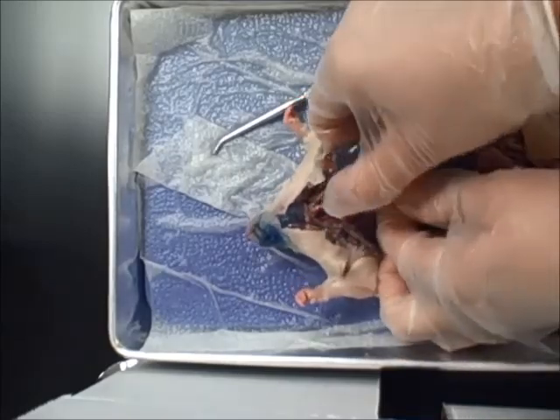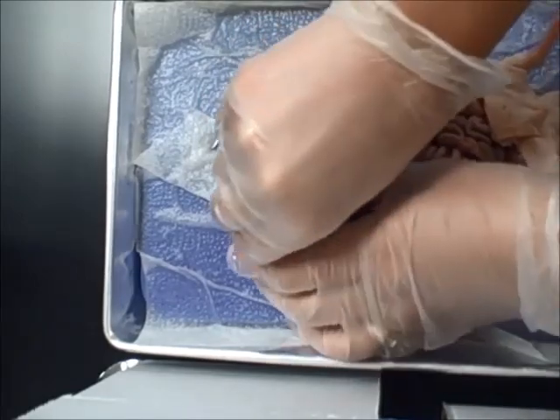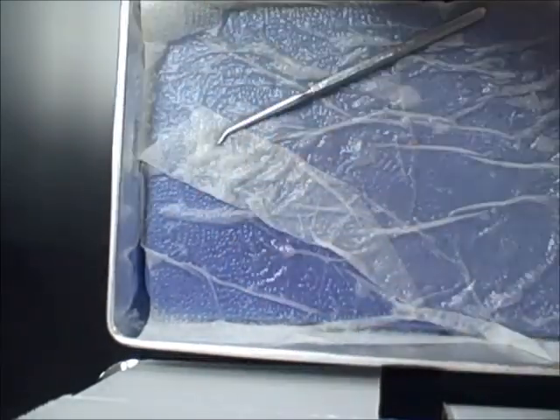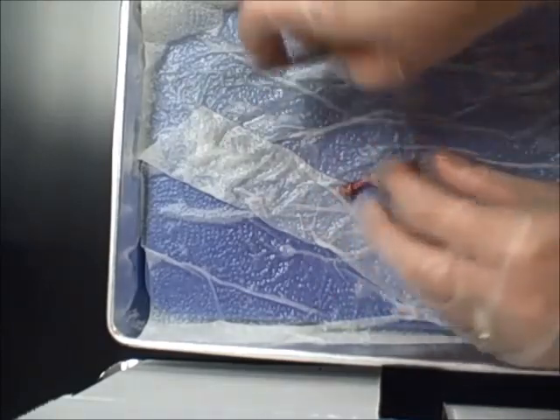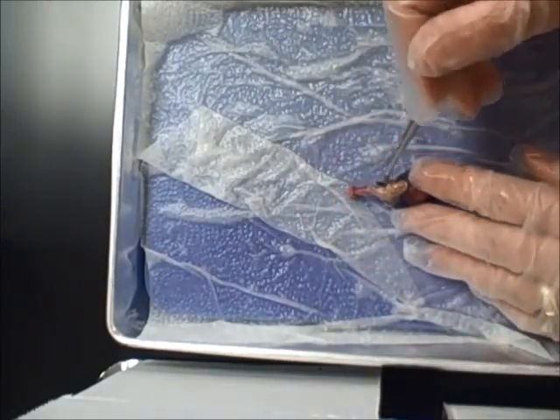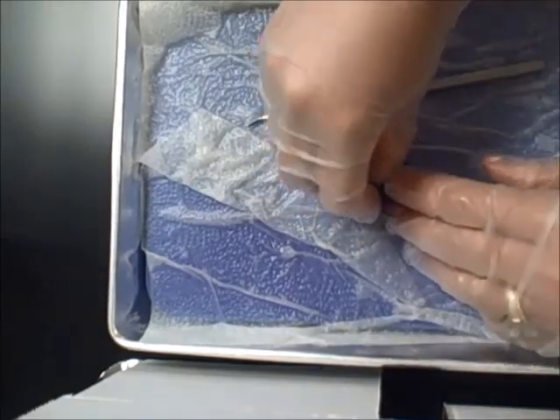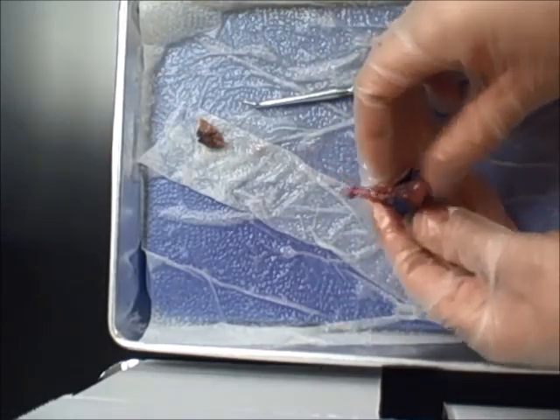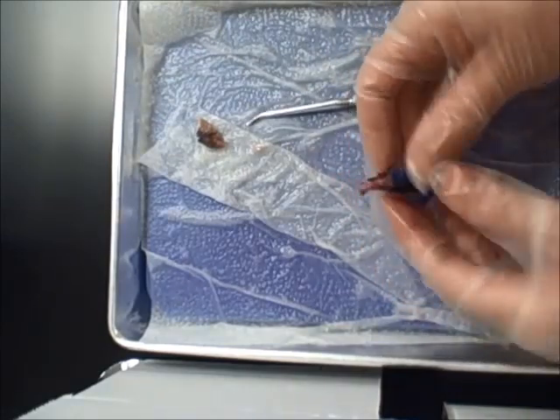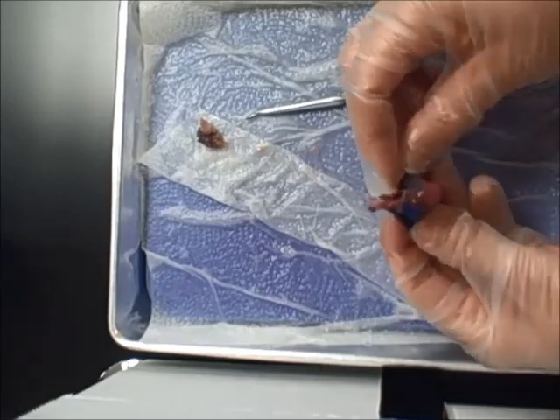So let me remove the heart, lungs, and trachea so you can see those. So here's the heart, lungs, and trachea. Also on top of the heart is the thymus gland in the immune system. After I remove the thymus gland, right in the middle of the lung, so here's the right lung here, the left lung here, you see the heart. Heart, remember, has 4 chambers.